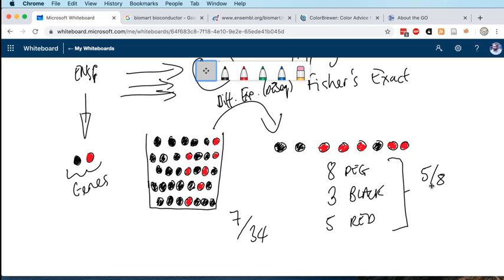So what you'll find with the hypergeometric test in this situation is that this isn't a random draw. That when we've picked these 8 genes, we have enriched for the genes carrying the function that's denoted by the red color, which I said before was viral response.